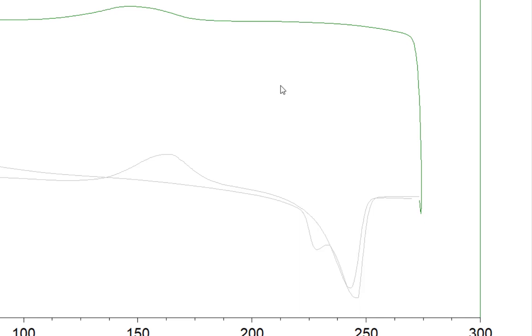So I've mentioned that heat flow in and out of the system is very important to the calculation. Sorry, heat flux is very important to the calculation of heat flow. And so when we go to change from a constant heating rate to a constant cool, then there's going to be some fluctuations. And we don't include that in, we don't assume that's like a melt peak or anything.